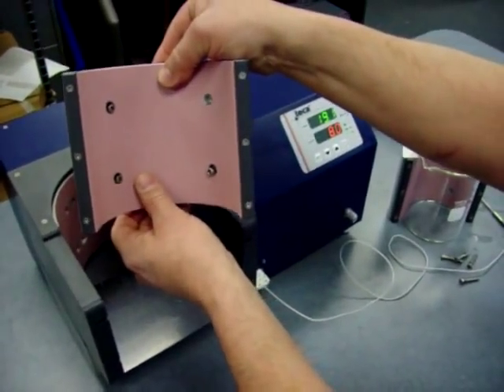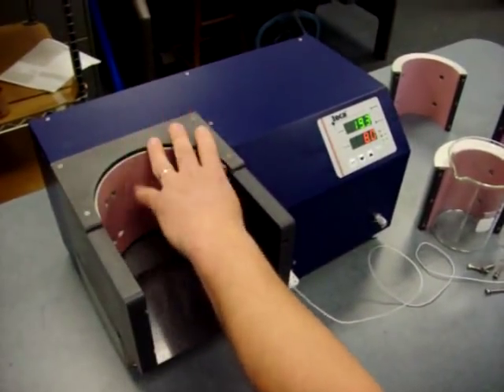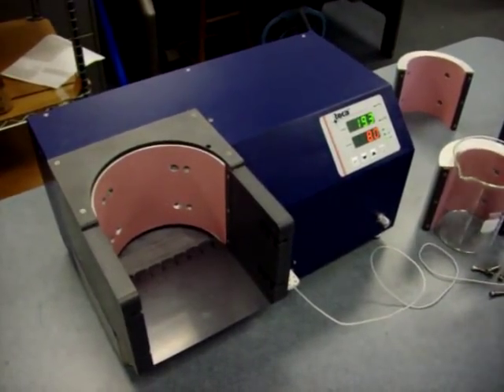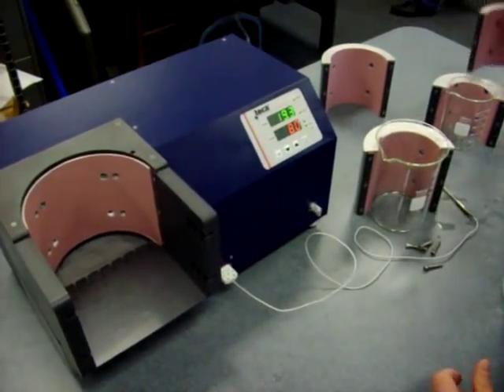Here comes what we call the sleeve - it pops right off and leaves behind what we call the shoe. This is the way the unit comes stock. The sleeves of various diameters for different size beakers are optional.